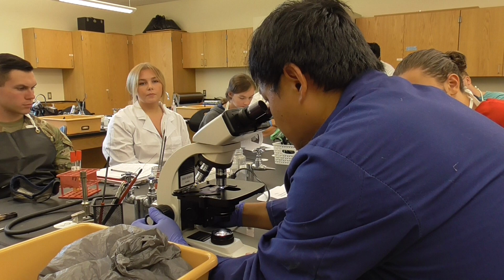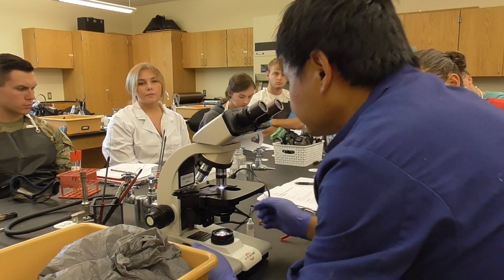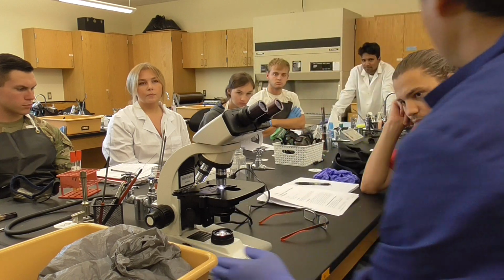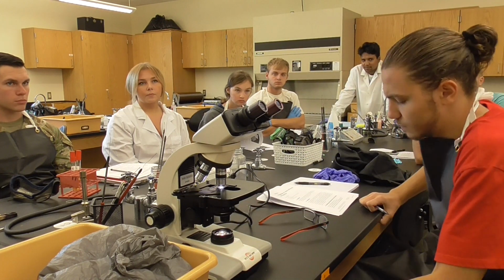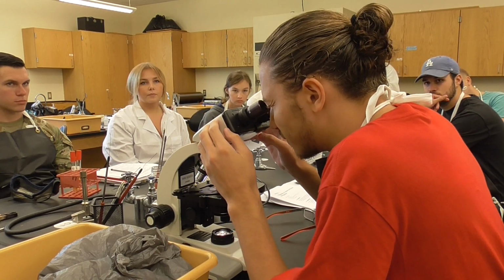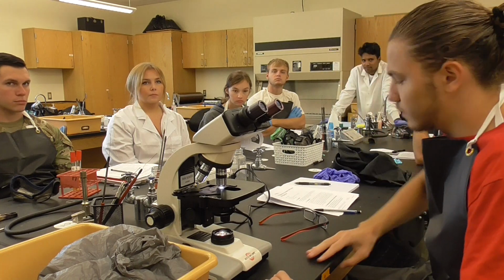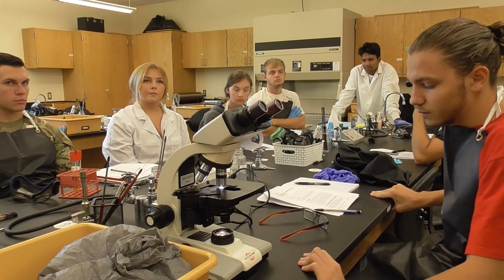Okay. Kind of, we can see something. So we move right here. And you can go ahead to see. There is some of the rods there. Can you see it? Yeah. The short rods. Go ahead to see it again. It is more clear. But of course, you see there's some fuzzy there.